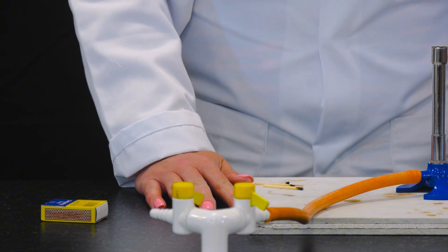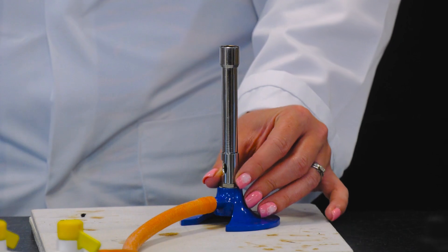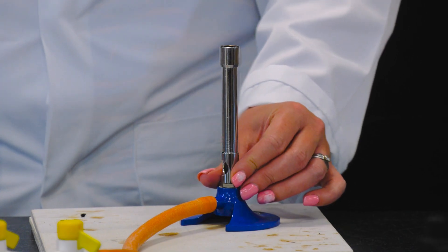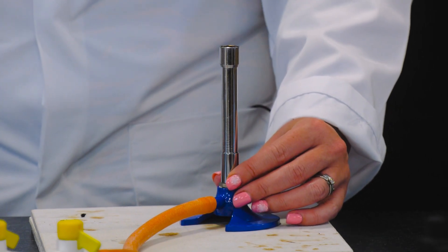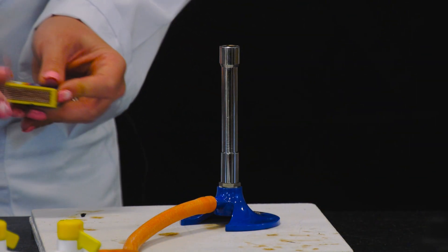Before lighting the Bunsen burner, ensure the air hole is closed by turning the collar. This will produce a yellow safety flame, which is easier to see.